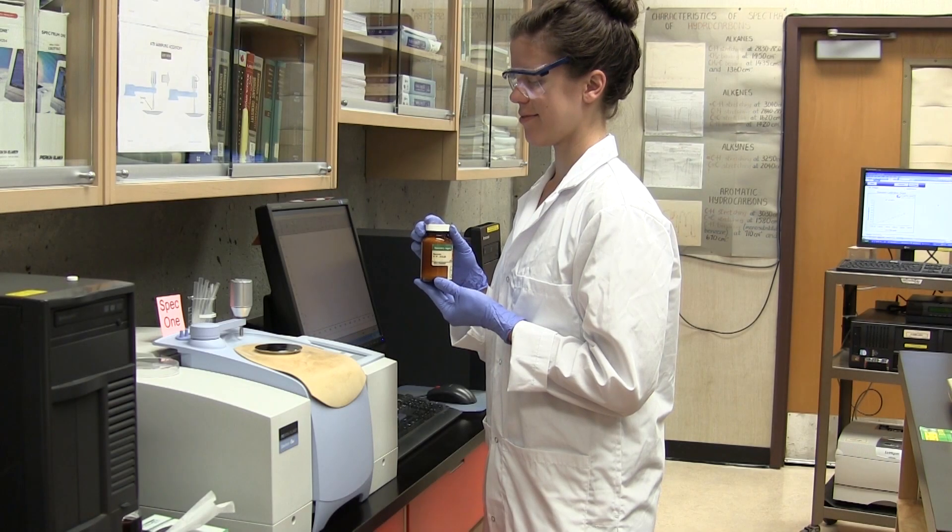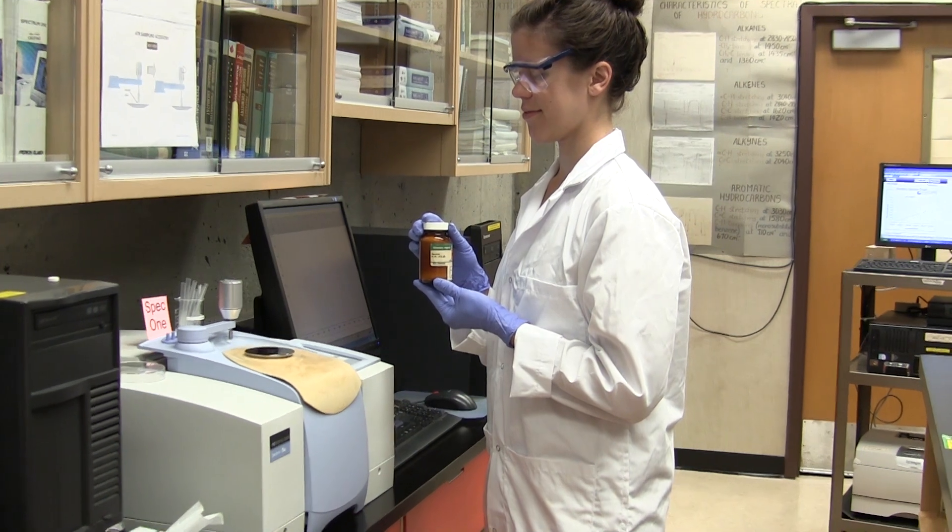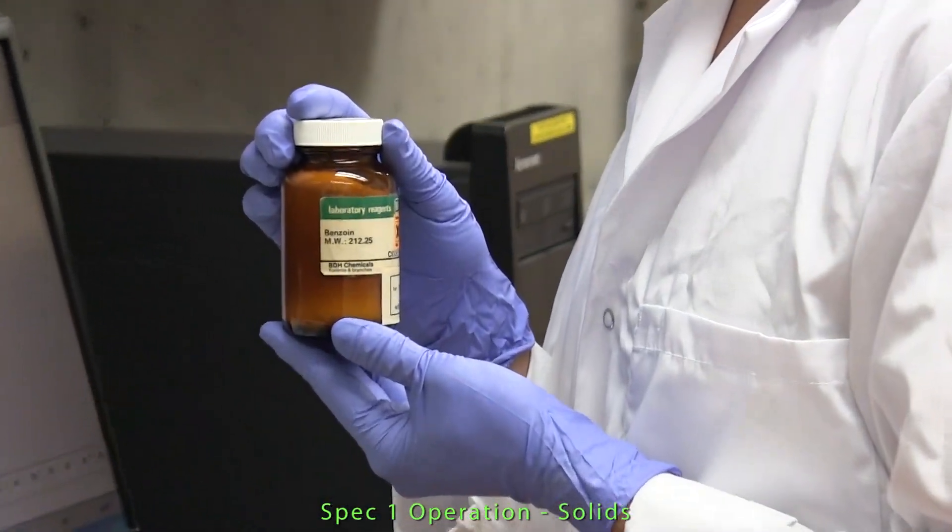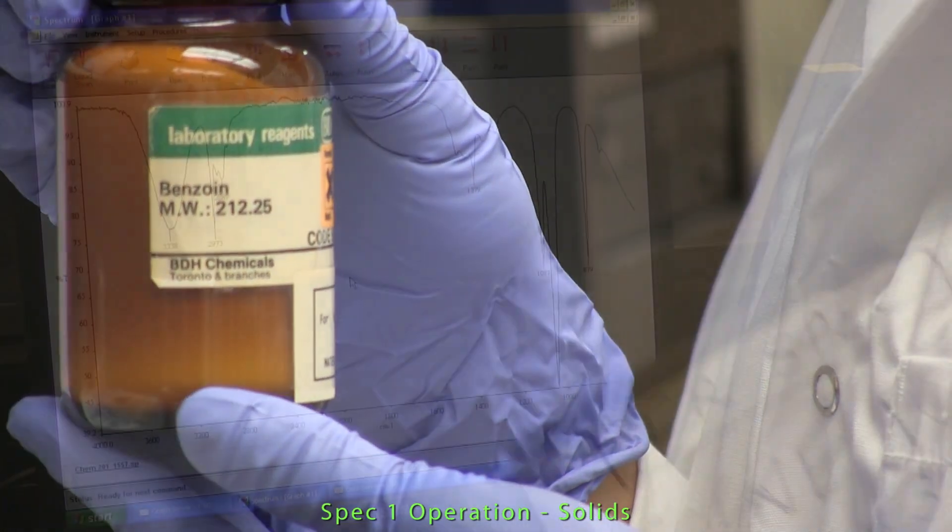So now let's take a closer look at how we prepare both liquids and solids for IR spectrometry. Lauren here is going to first obtain the IR spectrum of a solid, in this case benzoin, using the ATR on SPEC 1.